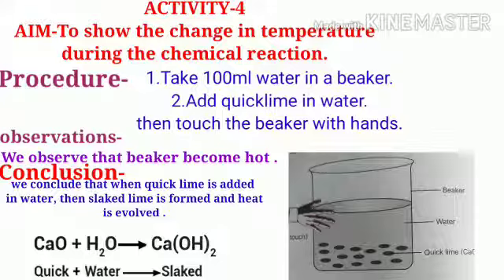First of all, take 100 ml water and add quicklime in water.